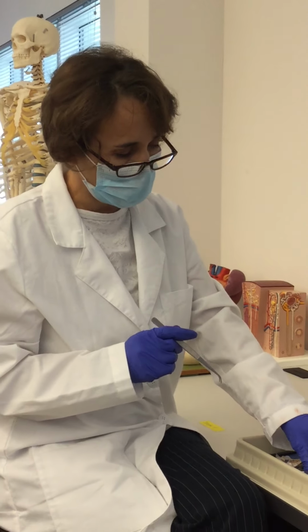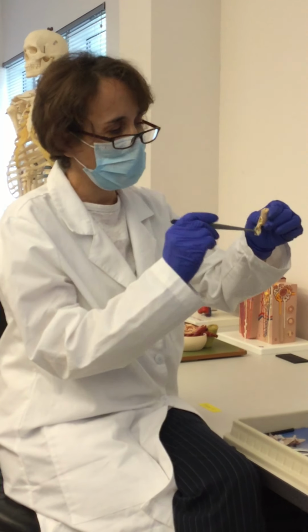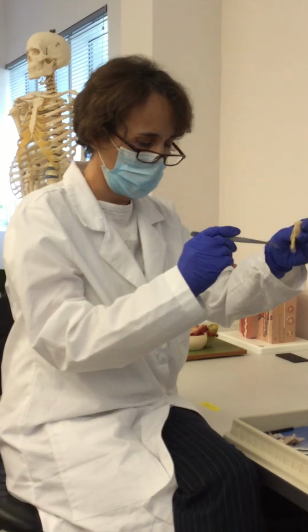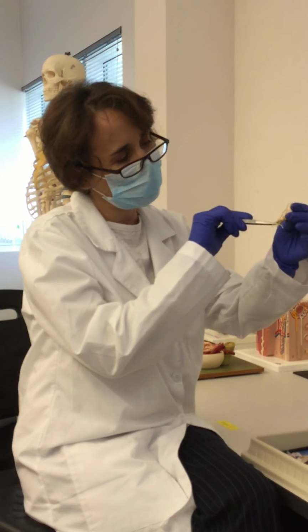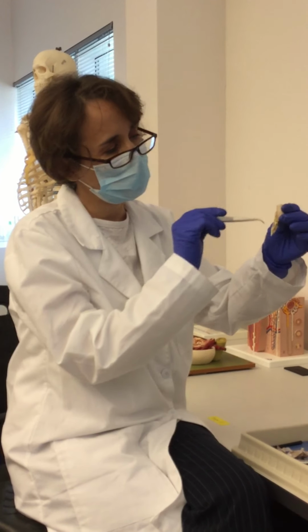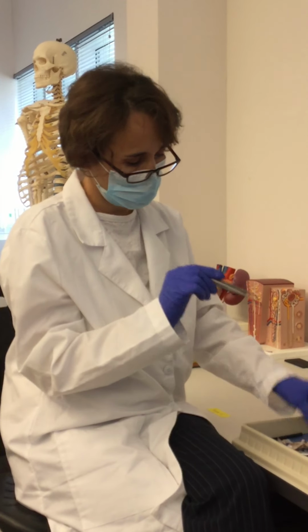So now here we have another spinal cord, which shows better the longer nerves emerging from the sides of the spinal cord. And this is all for this video.